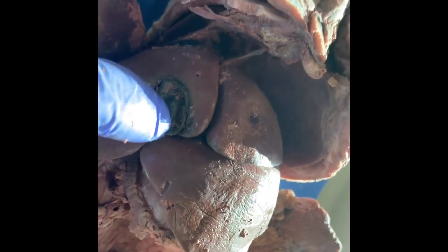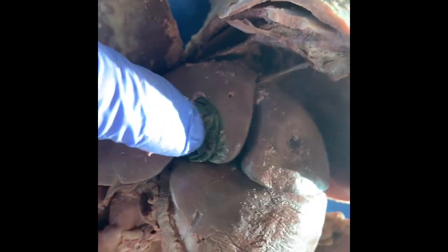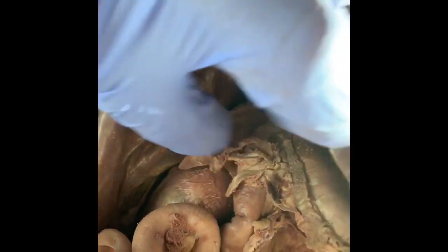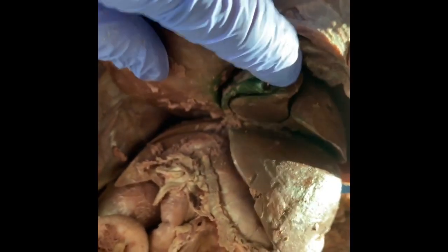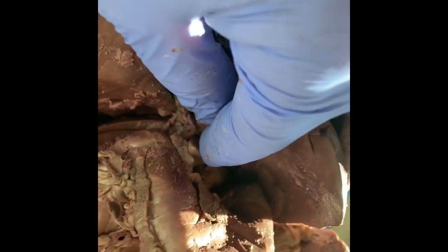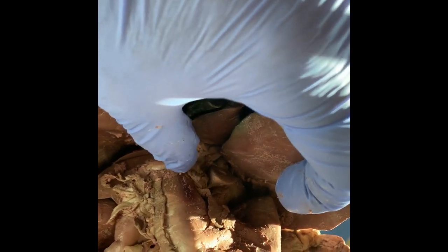Here's a close-up of the gallbladder. You can see it has kind of a green appearance, and that's from the bile. Again, this is the right medial liver lobe, left medial, left lateral, right lateral down here, and then the caudate lobe is this little one right underneath right there. You guys see, it looks like a little tiny kitty tongue.